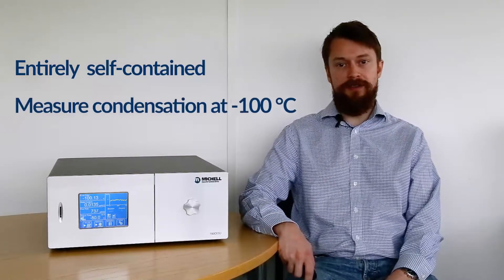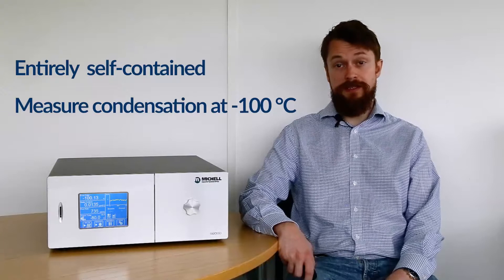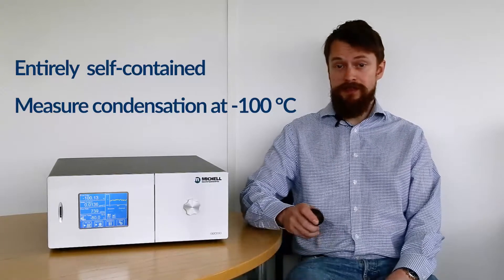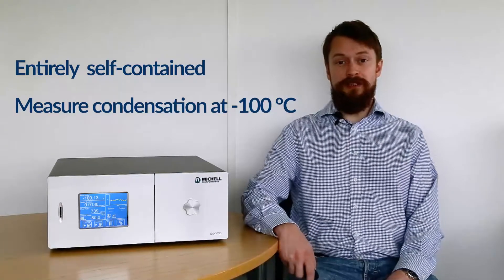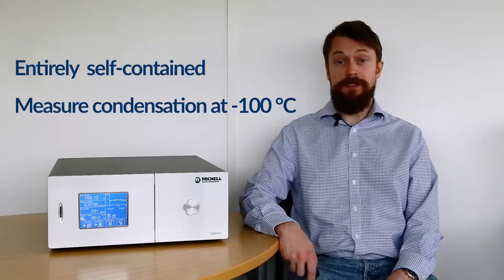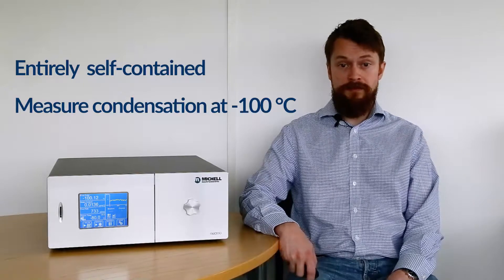Our engineers have developed it with the needs of national standards laboratories in mind, and it'll also have applications in research and development facilities. The S8000-100 is an entirely self-contained instrument with the capability to directly measure condensation at minus 100 degrees Celsius frost point. It's the first instrument on the market with measurement capability of this level in a practical package.